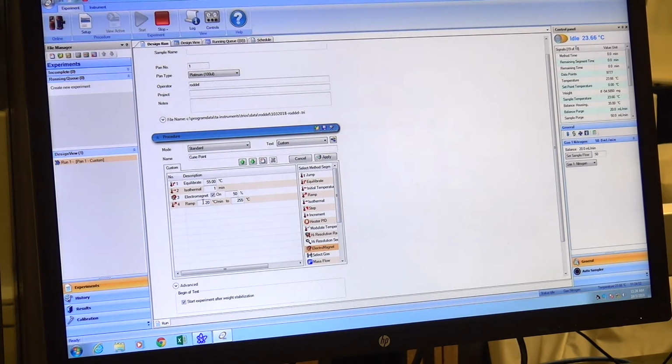Okay. So in this case, my ramp is 20 C to 255 Celsius, but I started at 55. So it's going to heat, right? So if I switch these two numbers around, it'll cool, right? So I just need to know what my final number is, and it will determine whether it's a heating step or a cooling step. So the ramp controls both directions, right?